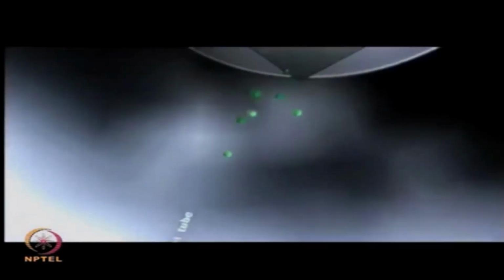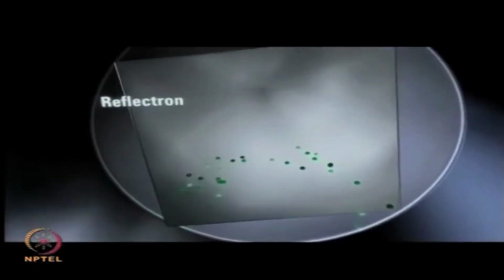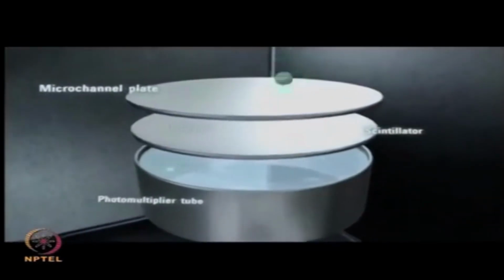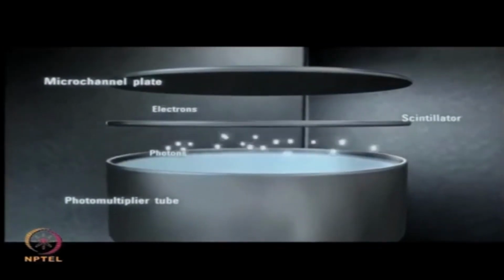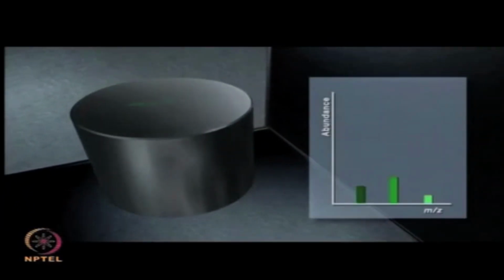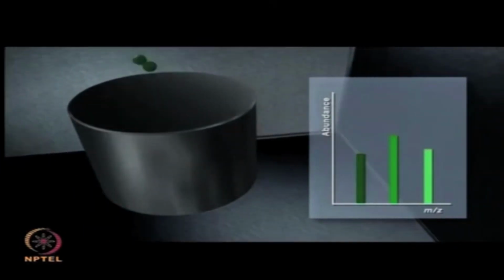The flight tube is constructed of special materials with very low coefficients of thermal expansion, so it is less sensitive to temperature changes. The reflectron compensates for minor velocity differences, improving the resolving power of the 6510. The microchannel plate detector converts the ion signal from electrons to photons and back to electrons. This electrically isolates the high voltage flight tube and front of the detector from the signal passed to the electronics. ADC digitizer electronics provide extremely high mass accuracy over a broader dynamic range.